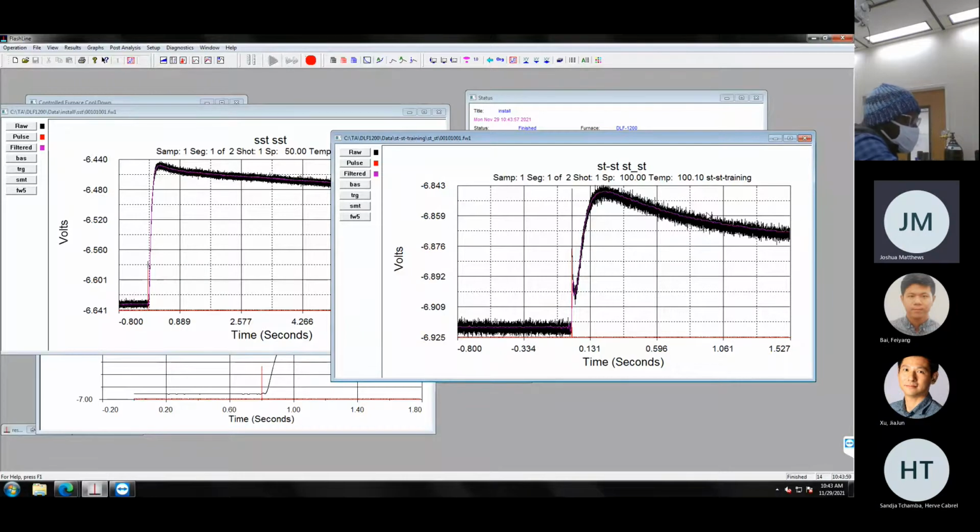Okay. But when you have sputtered the gold, how do you subtract that diffusivity? I guess how does that affect your diffusivity value? I'll let applications go through that with you. They have more experience sputter coating and running sputter coated samples than I do.